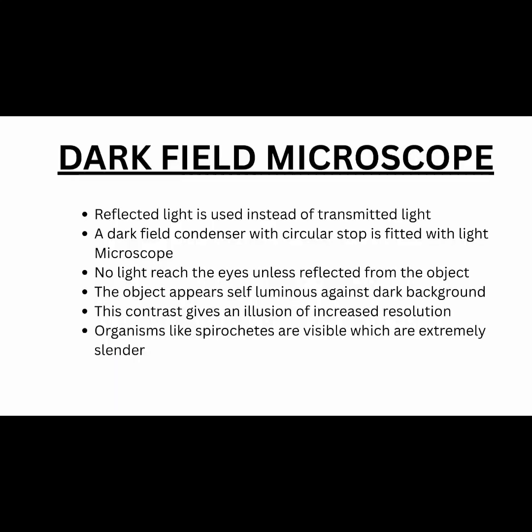So next is the dark field microscope. Here the reflected light has more importance. For phase contrast, the importance is that a difference in phase is created and contrast is created. Here the reflected light is used instead of the transmitted light. That is the major difference.